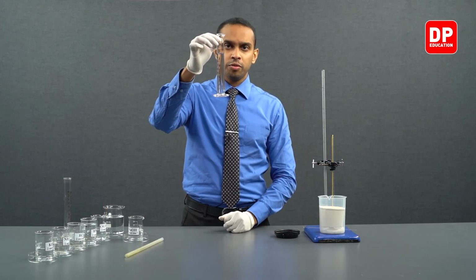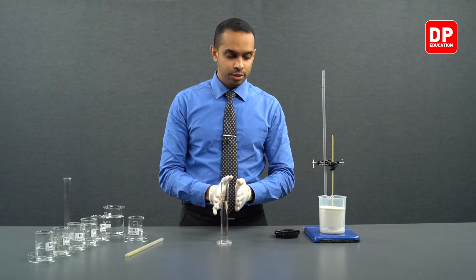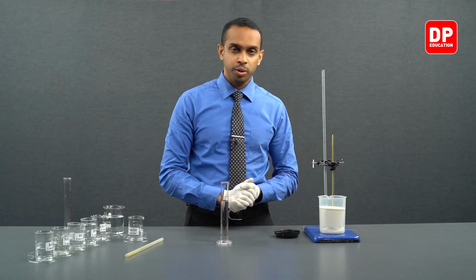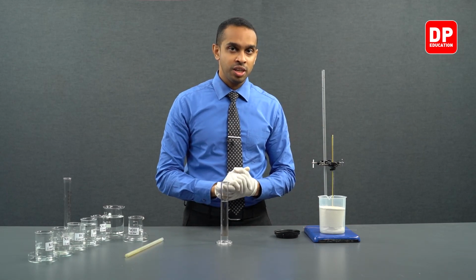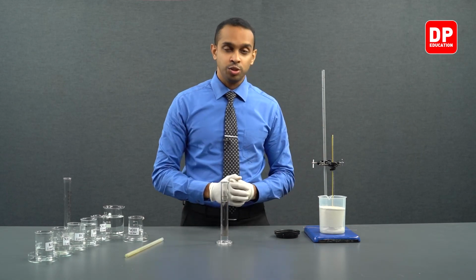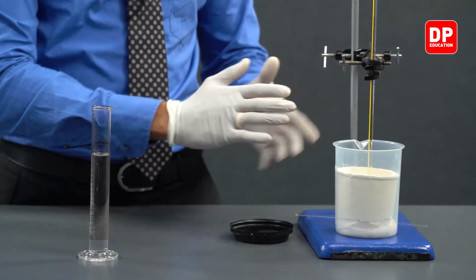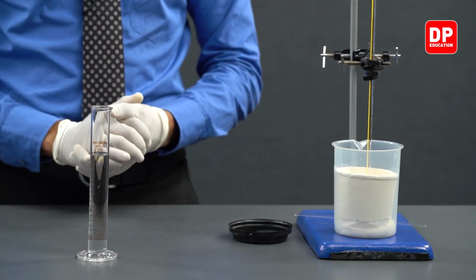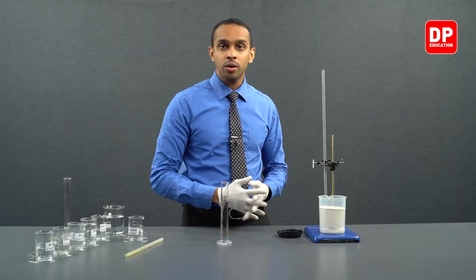After measuring 50 milliliters of sodium hydroxide solution, we have to add the sodium hydroxide into this reaction mixture, and as soon as you do that, you have to measure the temperature increase of this reaction mixture. At the same time, you have to make sure that you close the lid of this container so that you won't have any heat loss through the top part of this beaker.